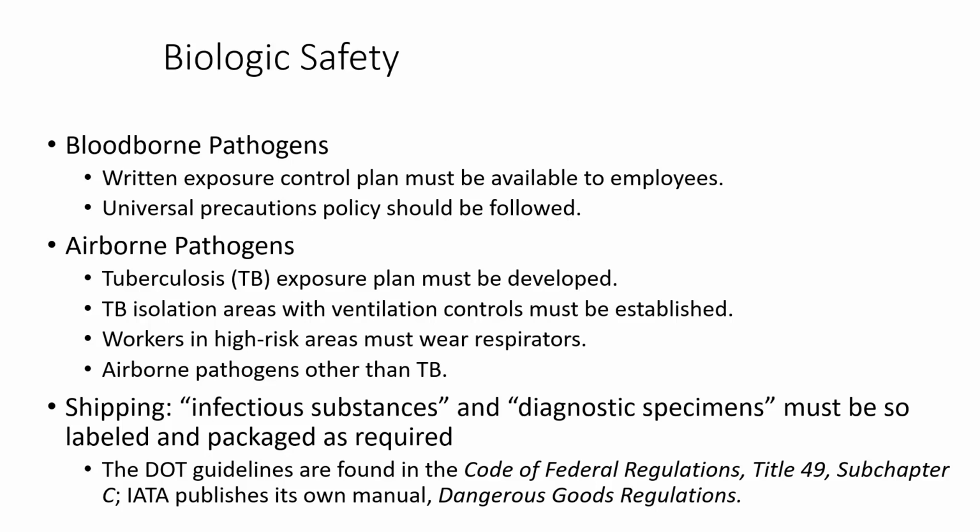Shipping. Infectious substances and diagnostic specimens must be labeled and packaged as required. The DOT guidelines are found in the Code of Federal Regulations, Title 49, Subchapter C. IATA publishes its own manual on dangerous goods regulations.